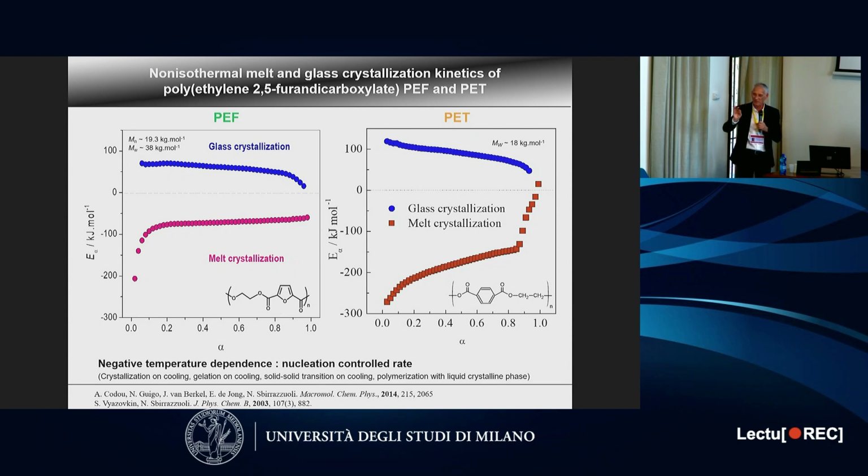At the end, you have some crystallization that is not really finished. So I think that since that time it was optimized. But as I told you, I think that we have a big difference between natural polymers and bio-based. Because if I look at the crystallization curves of PET, they are very nice, but not the ones of PEF.